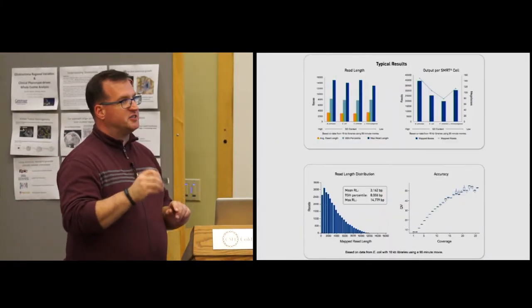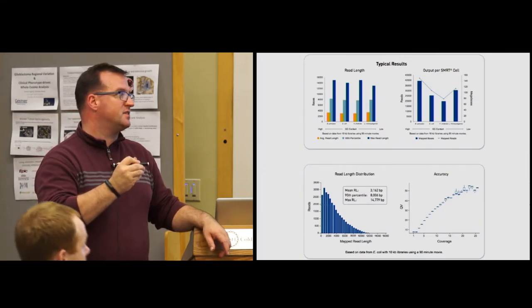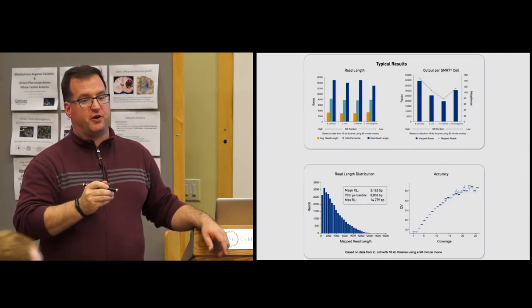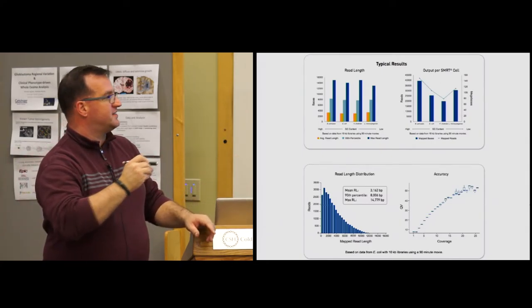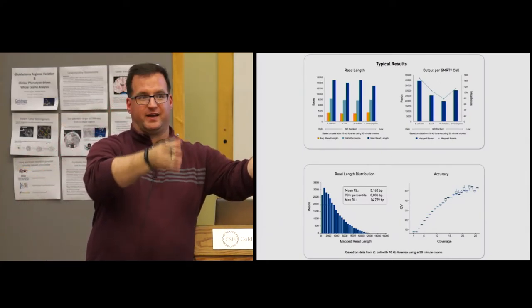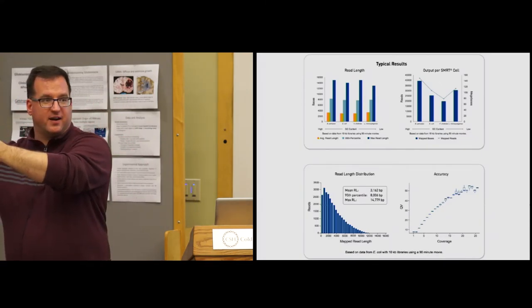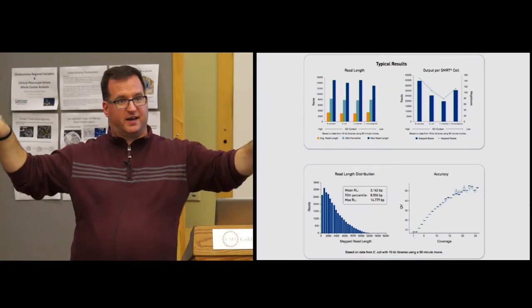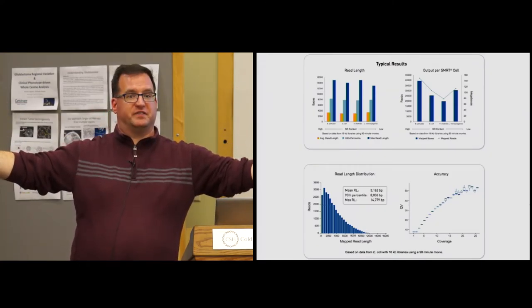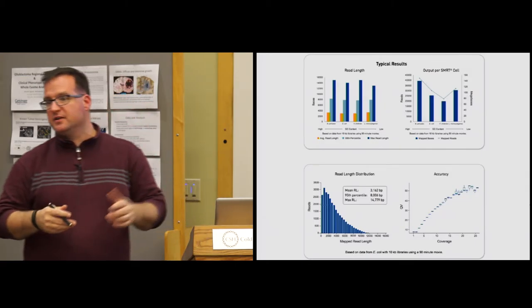And when we talk about genome assembly in a couple of days, this will come back into play. Because maybe sometimes for PacBio, you don't actually need to know exactly what the sequence is. You just need to know across 10,000 bases what I kind of think the sequence is here and what I kind of think the sequence is over there. Because then if I have a bunch of Illumina reads where I really actually know what the sequence is, I can fill that in, and I know the physical orientation of those reads because I can use this as a scaffold. Okay?